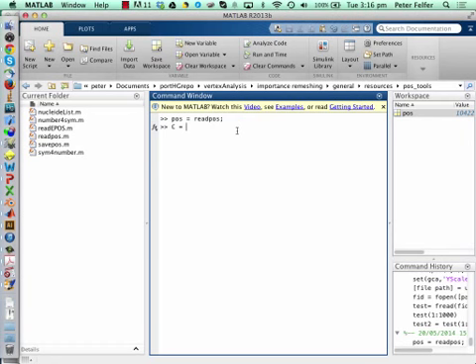If we do it by hand, then carbon is the pos file, and out of the pos file it's everything where the fourth column of the pos file is less than 6.5, and everything in the fourth column is also larger than 5.5. So there's everything around 6, and we want all four columns of that.